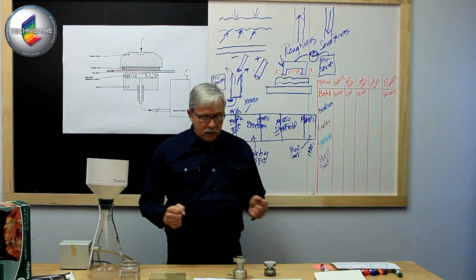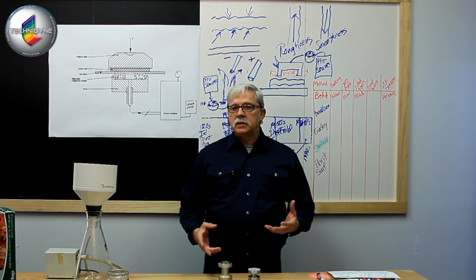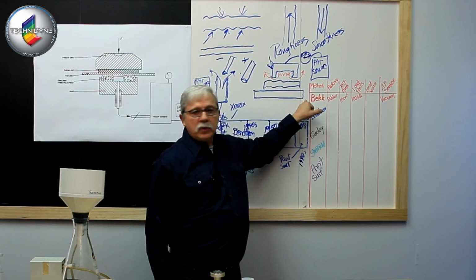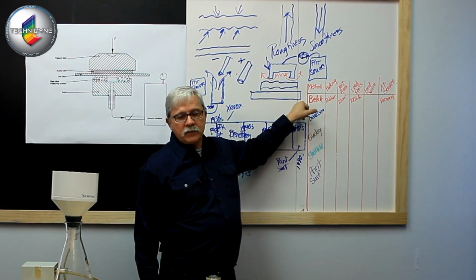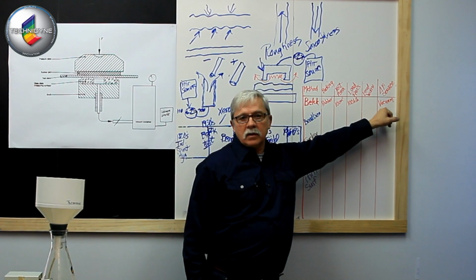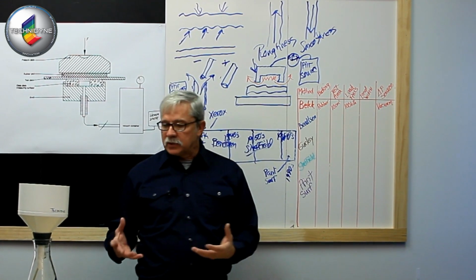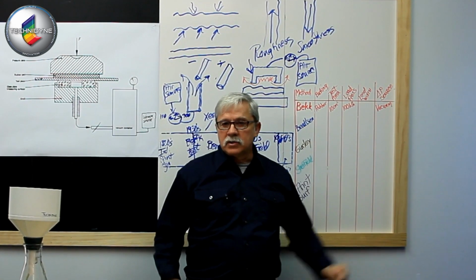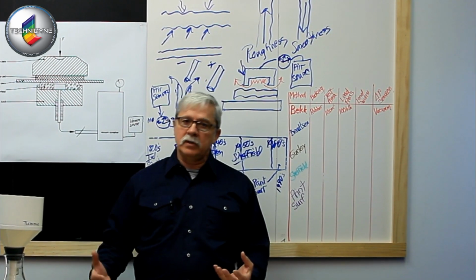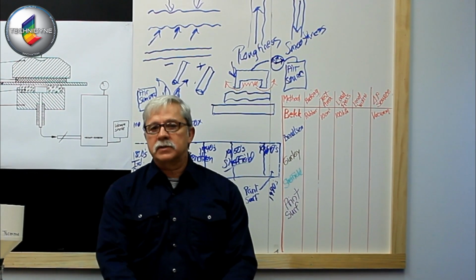All right, so all of these details, as I talked about, need to be maintained. And I've started a table here. I've input some of the details about the specifics of the Bekk test: the backing, the test area, the load pressure, and how we are creating that differential pressure from low pressure to high pressure. In this particular case, we're using a vacuum, so we can create that situation where we have an area of low pressure and an area of high pressure and actually see some air movement and be able to measure the rate of air movement across that surface.